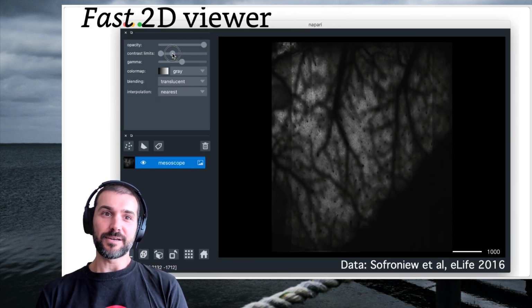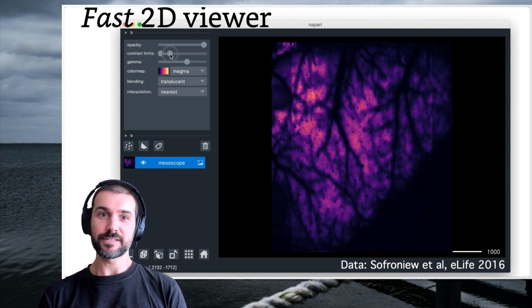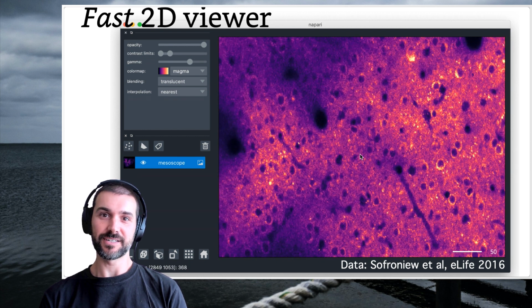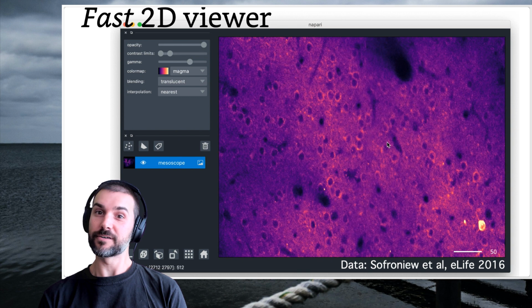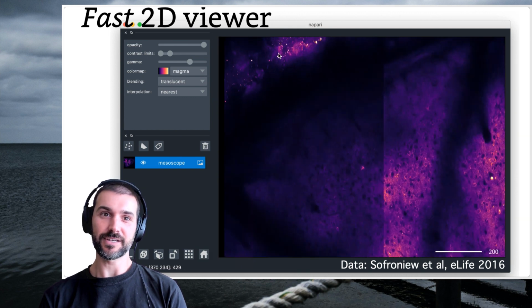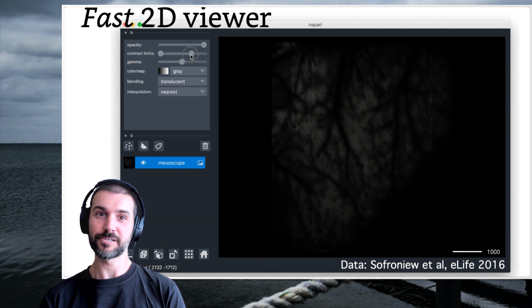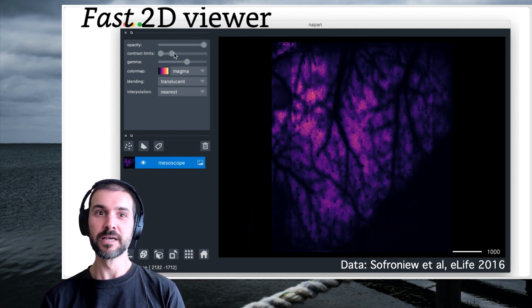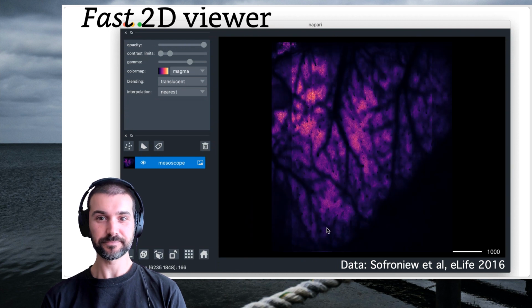So napari first is an image viewer. And it is very fast thanks to an OpenGL canvas, which is provided by VisPy, another open source project that we make use of. So this image is 5,000 pixels by 7,000 pixels, and the canvas actually supports up to 16,000 by 16,000 on most laptops, so you don't even need fancy hardware for it. OpenGL is really performant, and so looking at your images is buttery smooth, really nice to use.